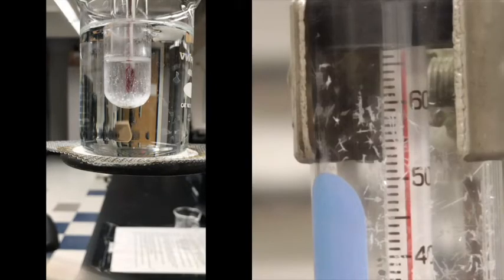See a little crystallization, looks like it's occurring. Oh, there you go, 65. So start. Every 30 seconds you need to be taking a reading. Remember, you should have 1 decimal place. It should be a 0 or a 5. Okay, and with each time that you take a reading, you should be noting what the sample looks like.